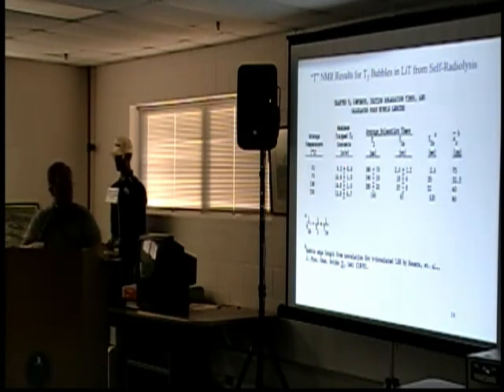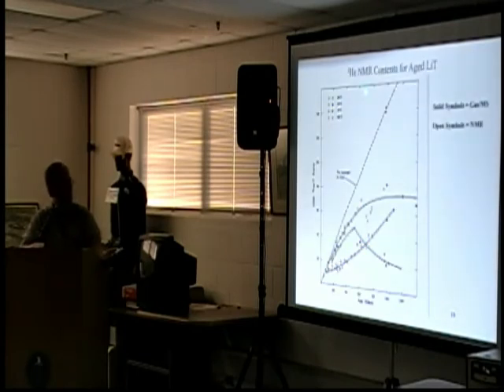Now we are, of course, looking at the helium in the next slide. This shows the helium-3 content that we got. And in here, for the helium-3, we had two types of measures. Open symbols were from NMR spin count. The solid symbols were from decomposition, mass spec analysis of the helium-3 that was released. For the samples that were stored at minus 40, what we found was all the helium was retained in the material. But depending on the storage temperature, this is room temperature. After about 2 years, 40%, you saturated how much helium you would get.